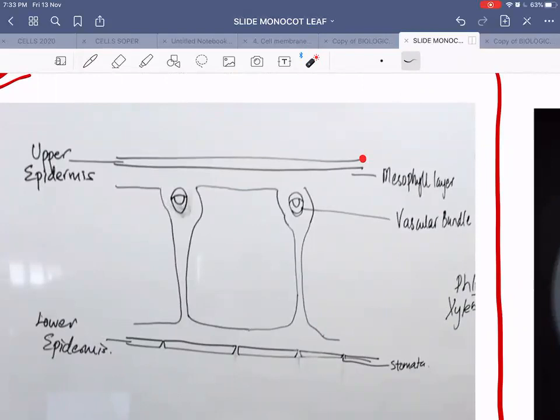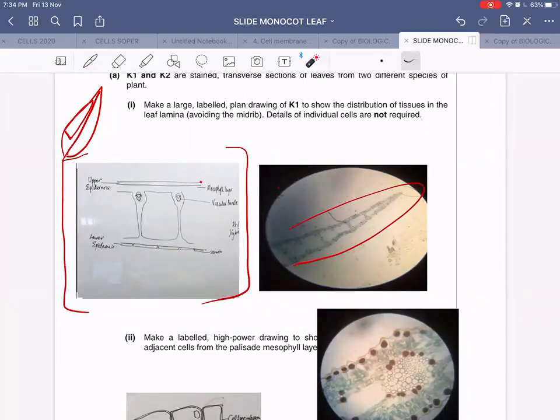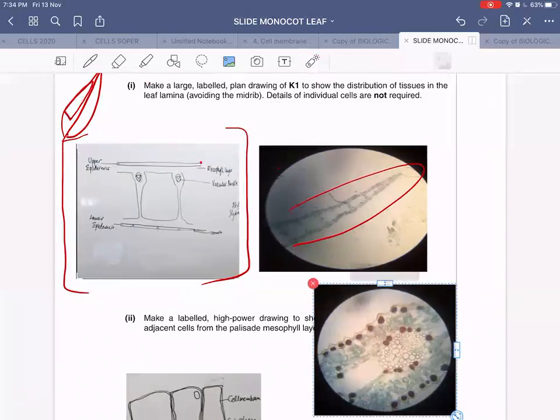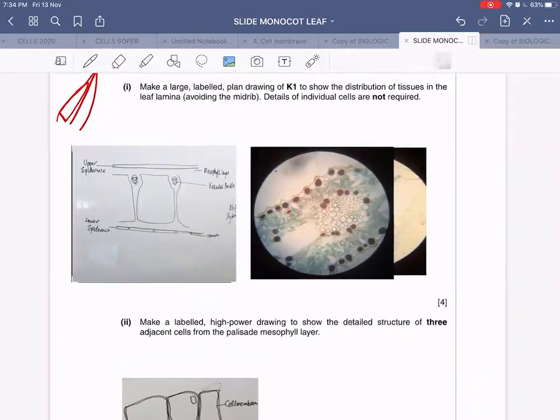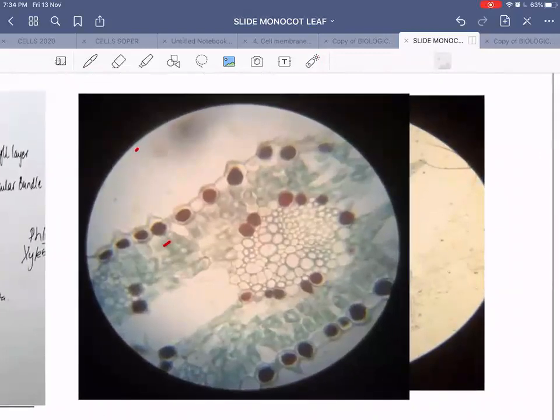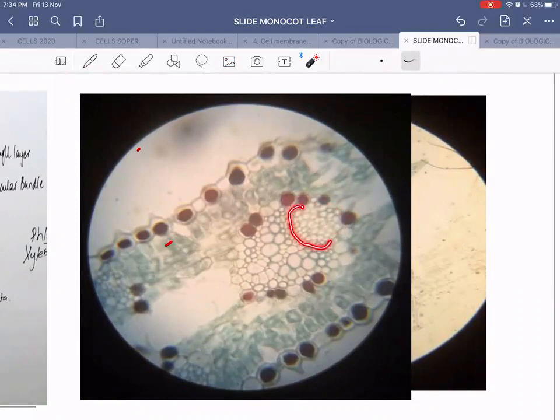To observe the different layers in the vascular bundle, zoom into your slide. The vascular bundle shows a small patch of sclerenchyma on top, then thin-walled cells which are the phloem, then the xylem, and below the xylem there may be another patch of sclerenchyma which may or may not be visible.